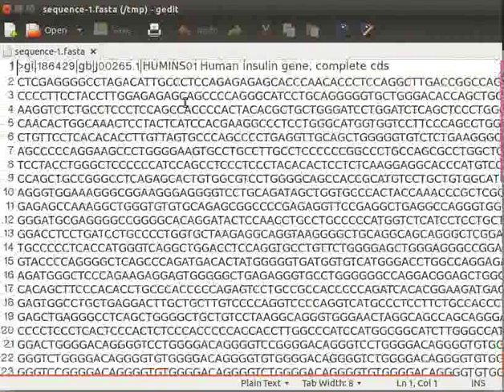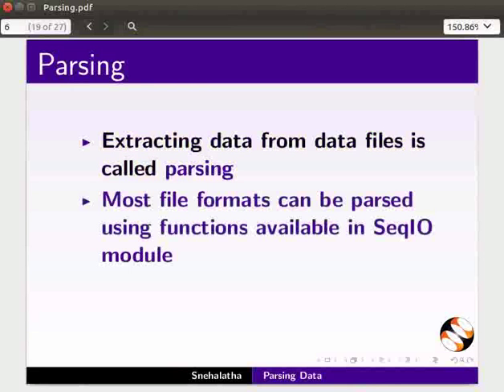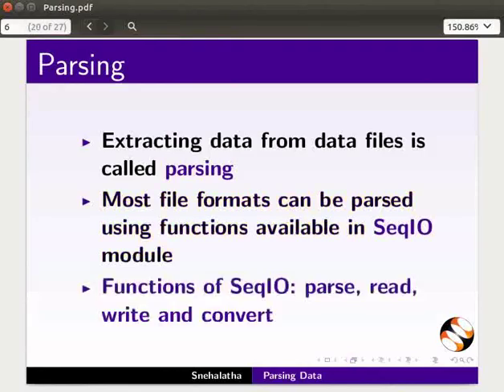Close the text editor. Extracting data from data files is called parsing. Most file formats can be parsed using functions available in the SeqIO module. The most commonly used functions of the SeqIO module are parse, read, write, and convert.